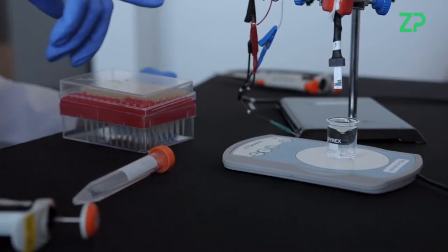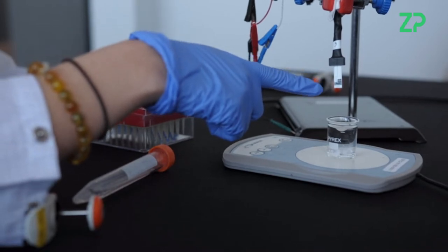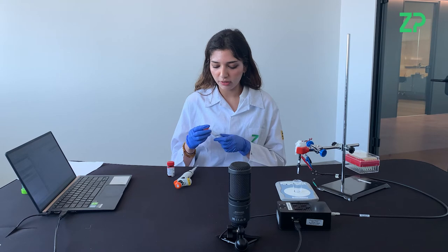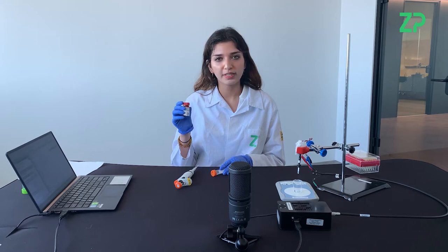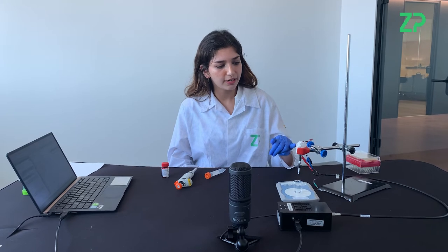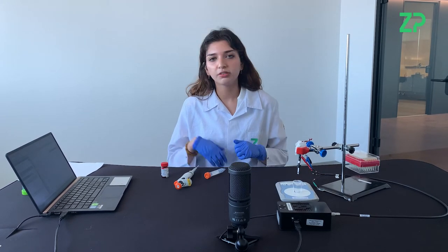For this experiment you'll need our ZP lactate generation 2 sensor. You'll also need a beaker with 10 milliliters of PBS. You'll need 0.5 molars of lactic acid in PBS, and that is made using L-lactic acid from Sigma. You will need an SPE connector which is connected via crocodile clips to our ZP anapot, and you'll also need to run this on a software — we're using PS trace.